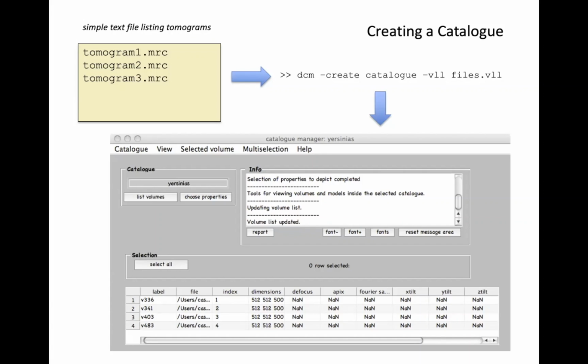People tend to create an Excel file that will become totally over complex in 3 or 4 weeks, and then it will be maybe a little bit too late to do things right from the beginning and create a repository or any other of the tools that we have in Dynamo to rationalize your work in tomography from the beginning.